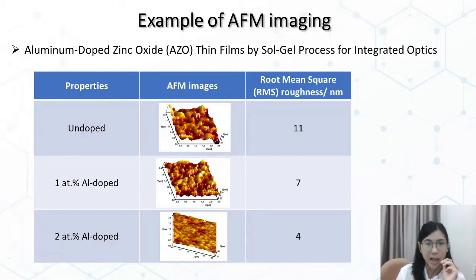The researchers are trying to find the best compromise to obtain a material with a low roughness. So, differences in surface roughness obviously lead to visual differences.